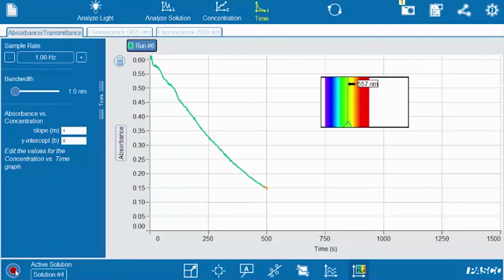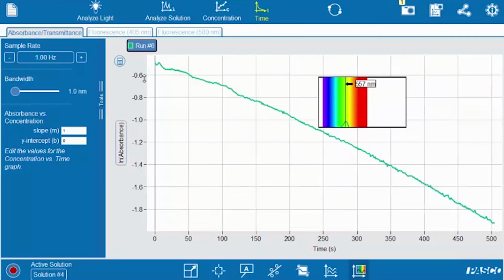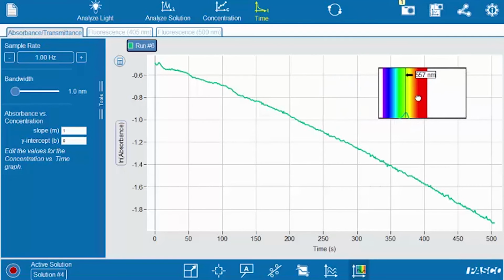And at this point, what we want to do is change the y-axis units to the natural log of absorbance instead of absorbance. So to do that, I use this little button that looks like a calculator. And you see that's 1 over absorbance, which isn't a straight line. But now we have natural log of absorbance. And what you can see is that in this region from 200 to 400 seconds, once we get out here, this line looks pretty straight. It's pretty linear. And so what that indicates is that in this region, anyhow, the reaction is a first order reaction.